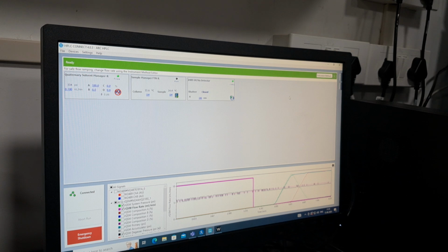We have given the proposed 0.2. It was on for the entire night. In the morning, around 7:30, there was a power cut. Yes, there was a power cut. So we will avoid this one.